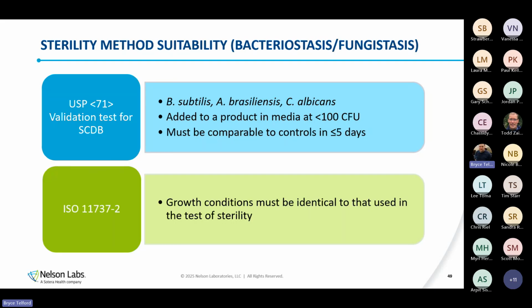And that's where the term due diligence comes in again. You're not just going to get one test, show that it didn't pass, and say, oh, well, this product's inhibitory. No, you're going to have to do your due diligence, which is usually multiple rounds of testing so that we can try different neutralizers, different volumes, sometimes even different incubation temperatures and parameters in order to try and get acceptable results. Only after our due diligence has shown we cannot neutralize this product is when we would proceed with testing.